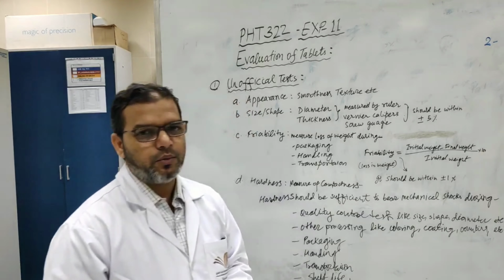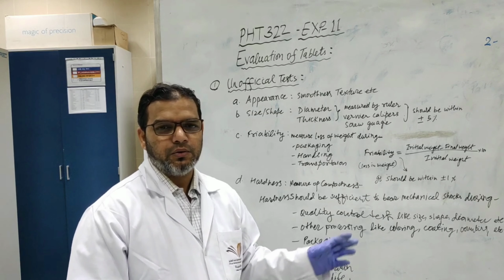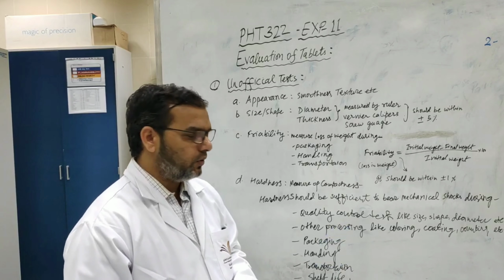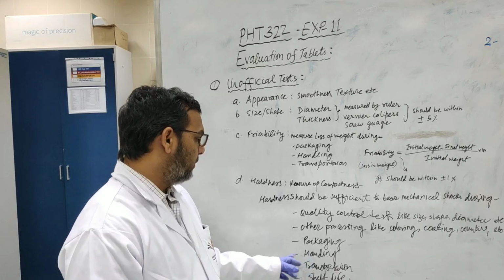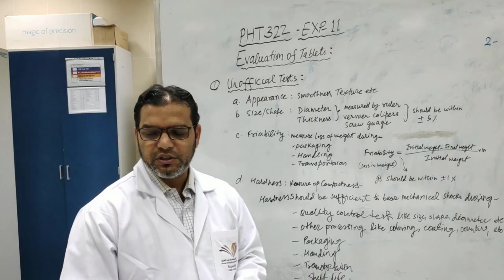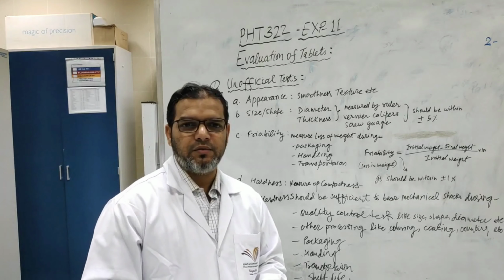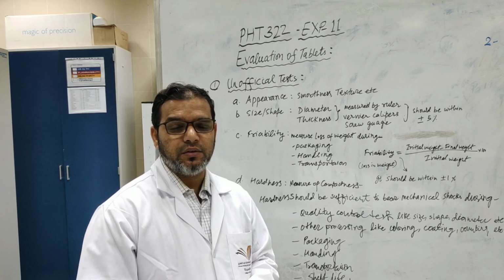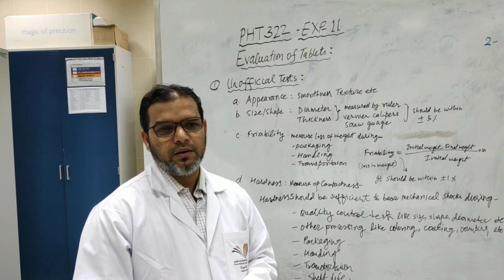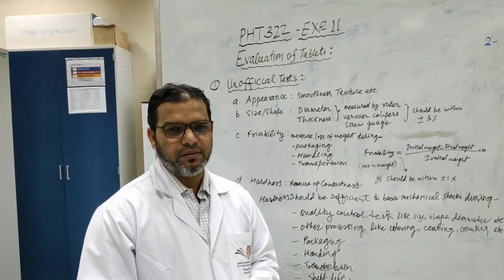So it is very important that you have a sufficiently hard tablet to bear all of these processing parameters. During packaging, during handling, during transportation, and during shelf life, if the shelf life of the tablet is 3 years, it has to be hard enough to remain intact throughout its shelf life.